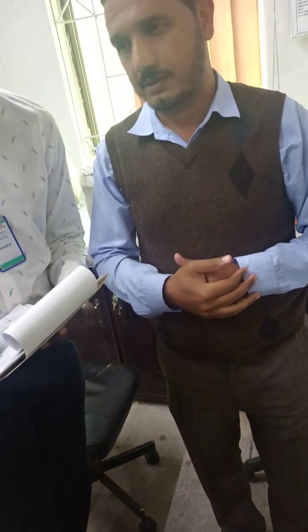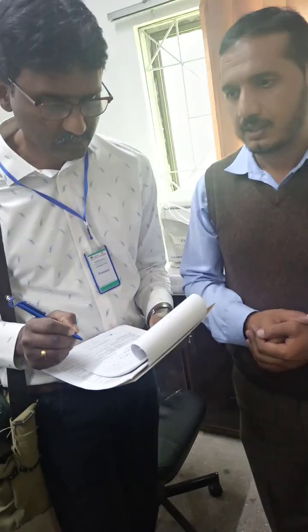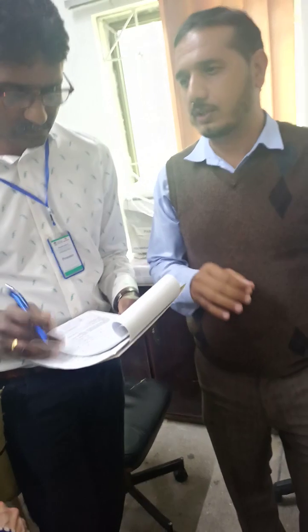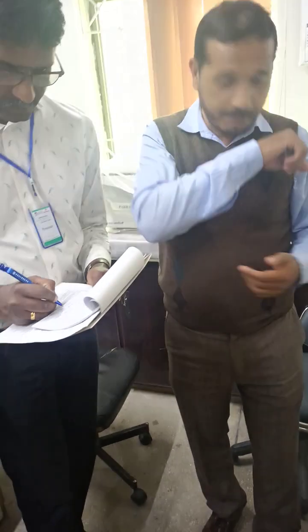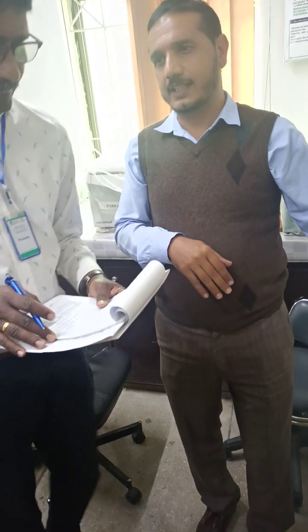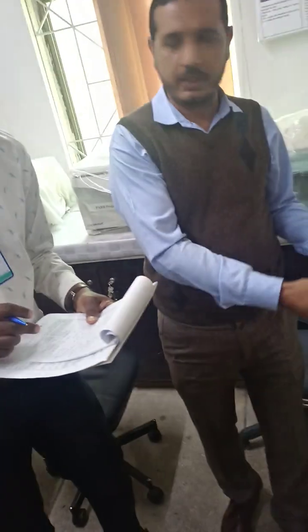That's the basic difference. So the only difference is a camera, and the quantification and the chemistry as well. Yes, because in this case you don't need to go for what we call post PCR processing. It means you don't have to take out the samples and run them on the gel.